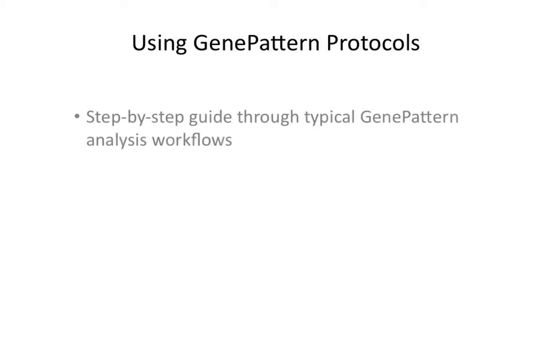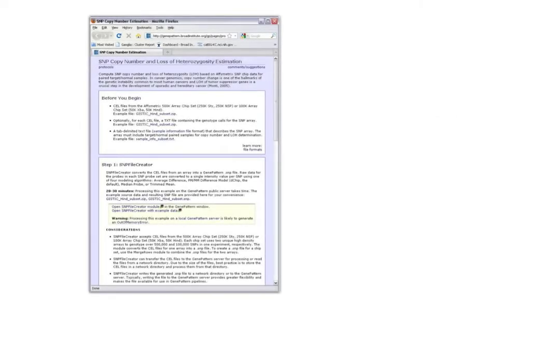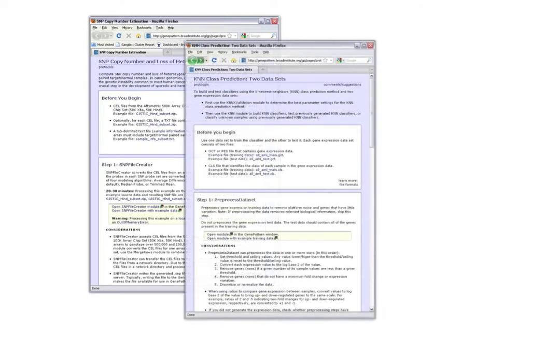A gene pattern protocol is a step-by-step guide through a typical gene pattern analysis workflow. Each protocol summarizes the aim of the analysis and the steps that will be taken. Each step provides detailed information about the analysis to be performed, both from a computational and a gene pattern functionality standpoint.